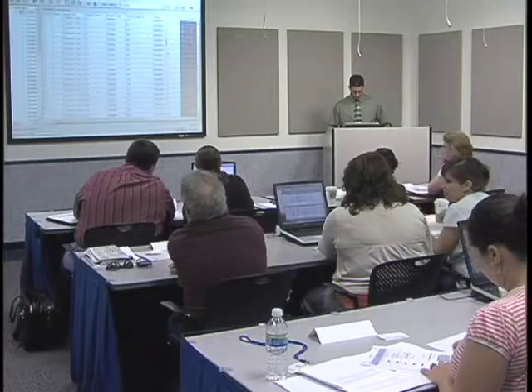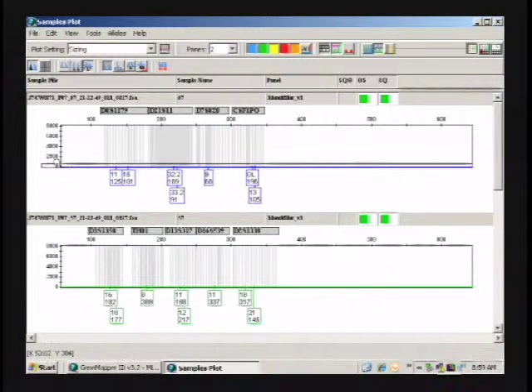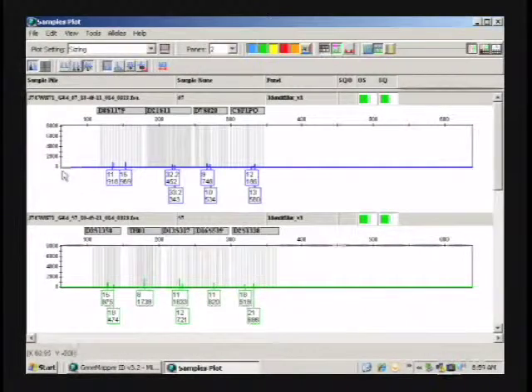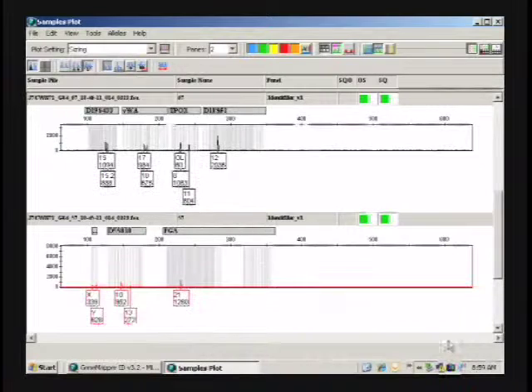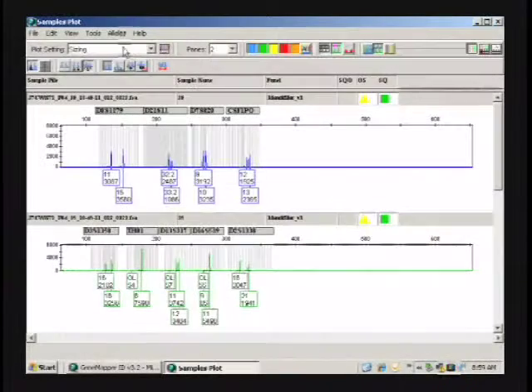Why do I have two things labeled 57? That might have been my typing. Let me check something. So 57 would have been a 0.05. So this is a fold increase for 0.05 definitely. And number 35 would have been a 0.1. So we can look at number 35, and you can see the 0.1 again is very high.